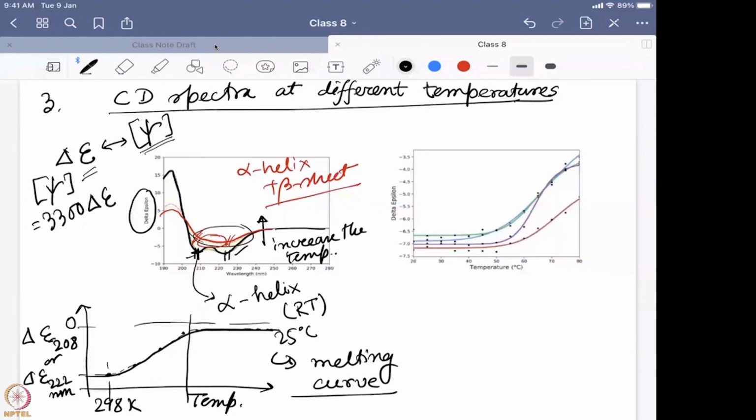structure of the condition. And over here, we take when it started and when it finished at the middle point. This middle point, we will say that is the melting temperature or TM. And that will define how stable a protein structure is. And over here in this particular data, that is the real life data that you are seeing.